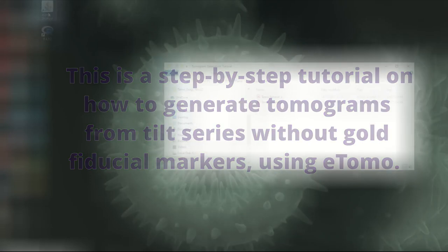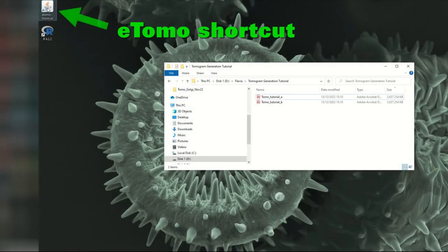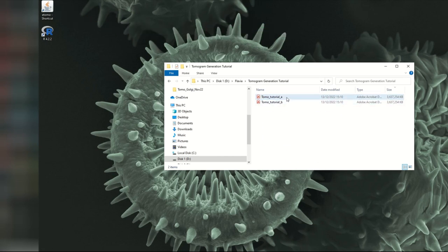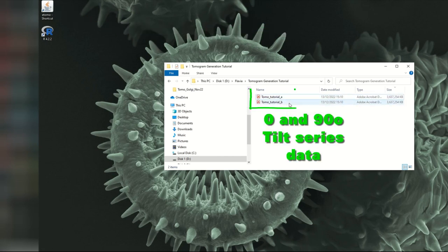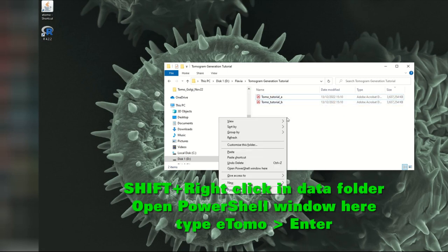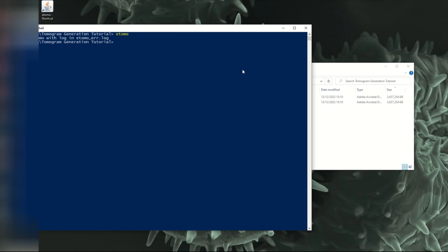You can either, if you have an eTomo shortcut on the desktop, double click on it, or you can simply from the folder where you have your data, so this is the raw data here, that's one axis and then the other axis of 0 and 90 degrees tilt. From this folder you can shift right click and then open a PowerShell window and then type eTomo and it will only see the files that are inside this folder.